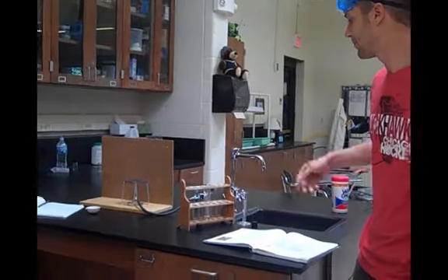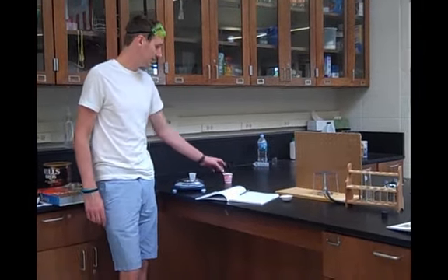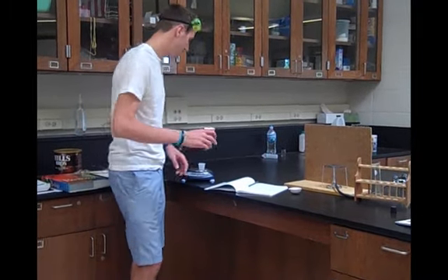Then the next thing you're going to want to do is mass 5 grams of your unknown substance.